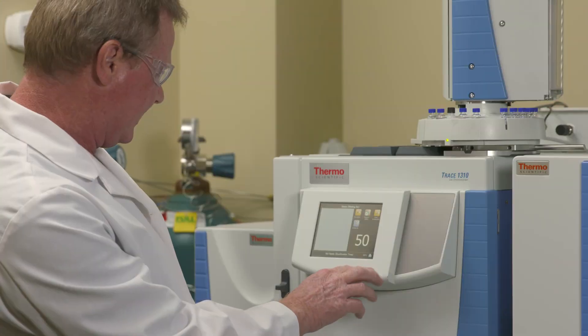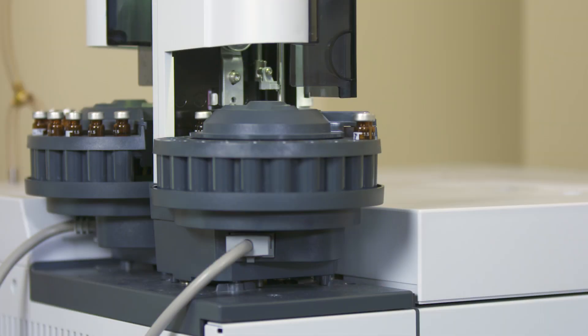Hi, I'm Mike Bouk. Young Living members know many of the rigorous and thorough processes behind our Seed to Seal promise. They may not know, however, that not only do we have methods in place to maintain ideal growing conditions or optimum distillation, but we also test our oils for purity all the way down to the molecular level.